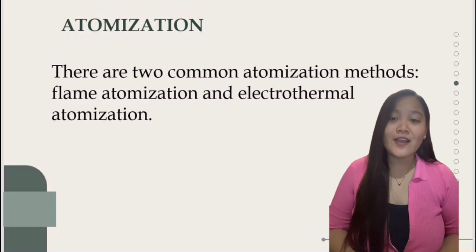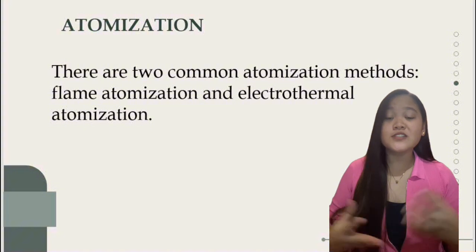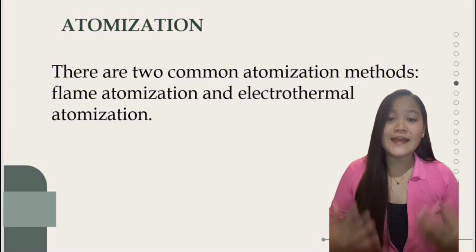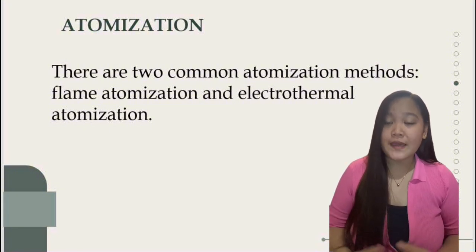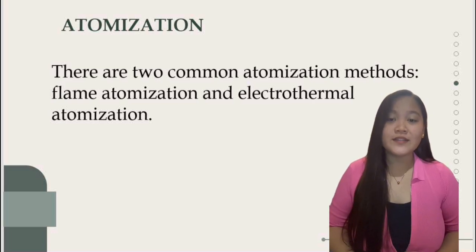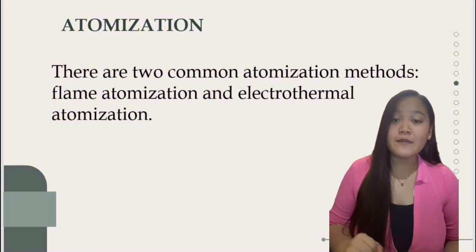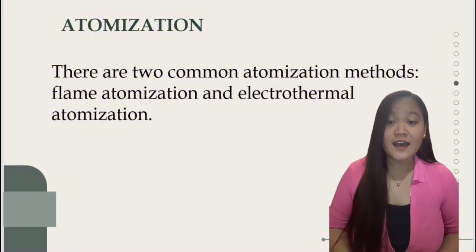With that, there are different atomization techniques. There are different methods to achieve atomization, and the choice depends on the specific analysis. Here are two common techniques. There are two common atomization methods, flame atomization and electrothermal atomization.